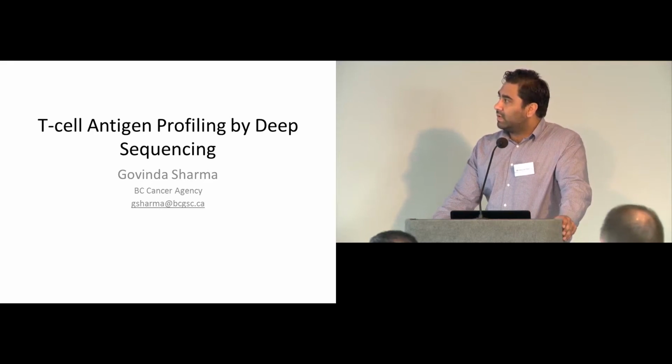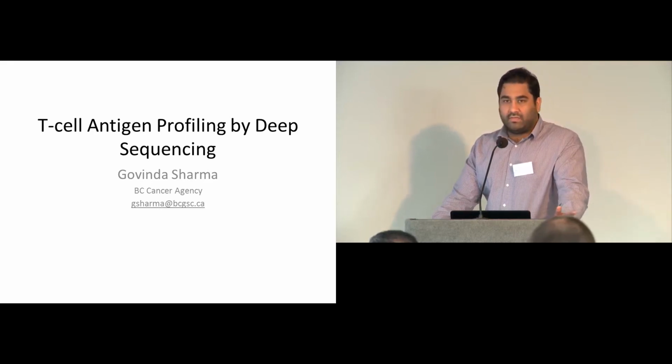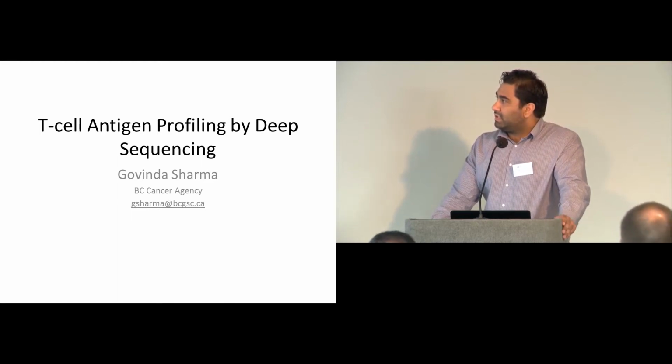So I'm going to talk to you today about a method I've been developing in the lab during my PhD to do high-throughput T-cell antigen profiling by deep sequencing.